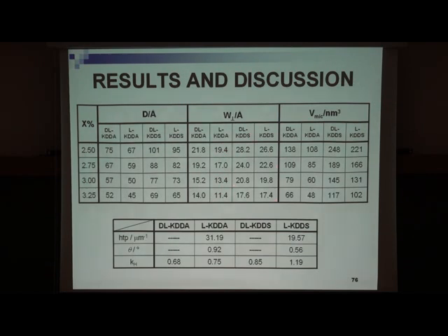I mean, as the concentration increased, the micelles get close to each other. And another important parameter is micelle volume. As the concentration of the amphiphilic molecules increased in the liquid crystal sample, the micelle volume gets smaller.